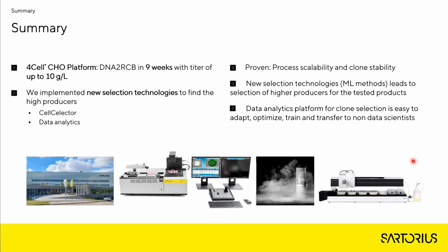We have proved the process scalability and the clone stability. We implemented a new selection technology to find high producers using cell selector data, data analytics, AI, and machine learning algorithms, and doing the automation in the lab.